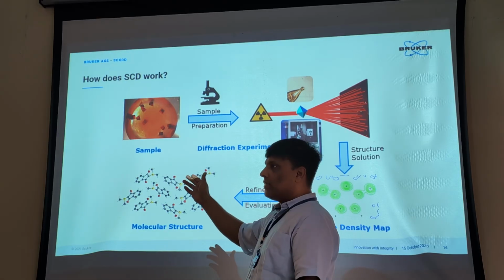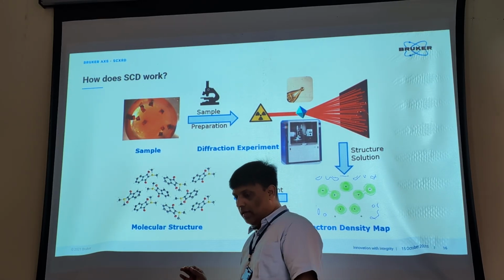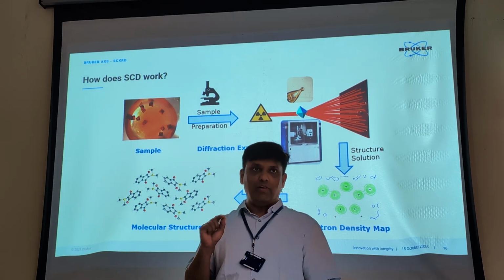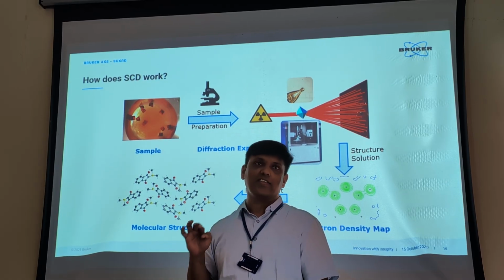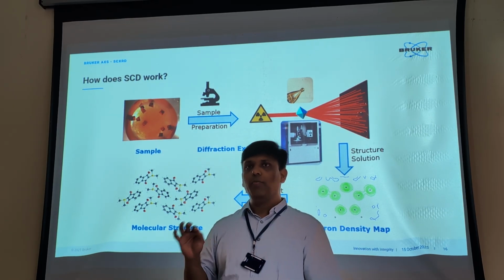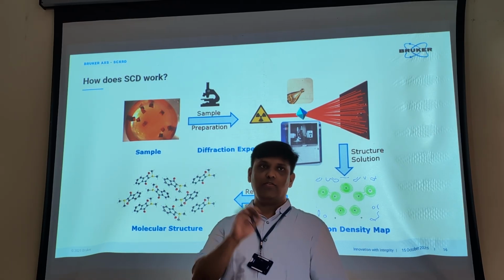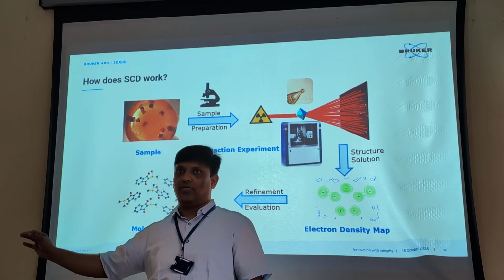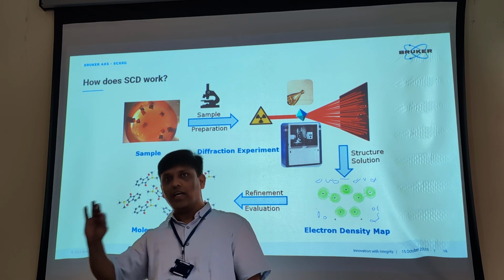Okay, so once you get that sample, the sample preparation is the crucial part. No experimental technique will work without sample preparation, and sample preparation is absolutely crucial. Single crystal is also the same. If you put in some rubbish crystal, the data will be rubbish. If you put in a good crystal, the data will be good. No instrument can make magic and give you a solution. Whatever your input is, the output will be as it is. Keep this in mind. If your crystal is not good, it will not be good. You cannot make it good.